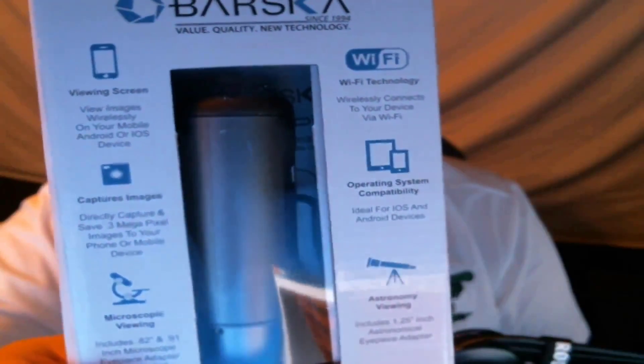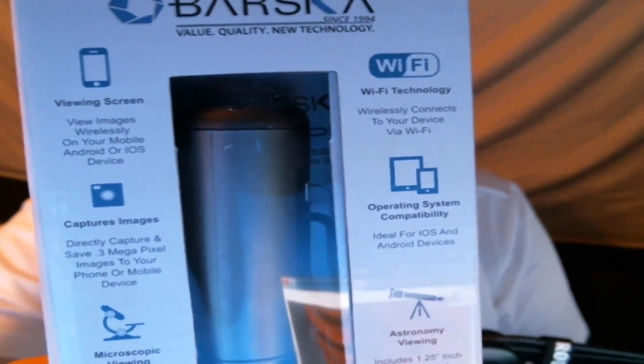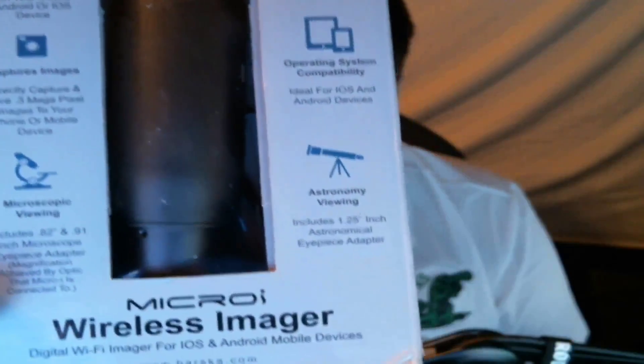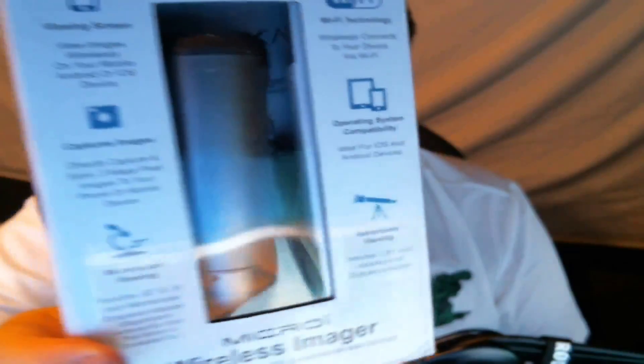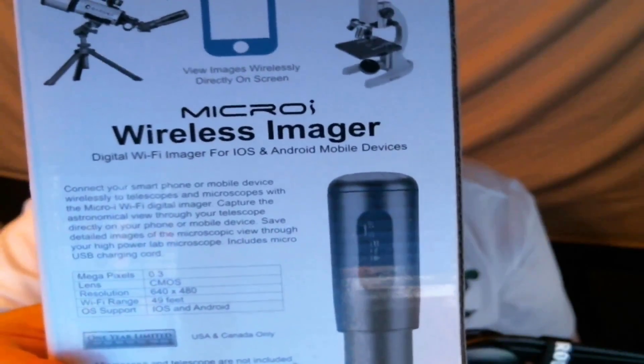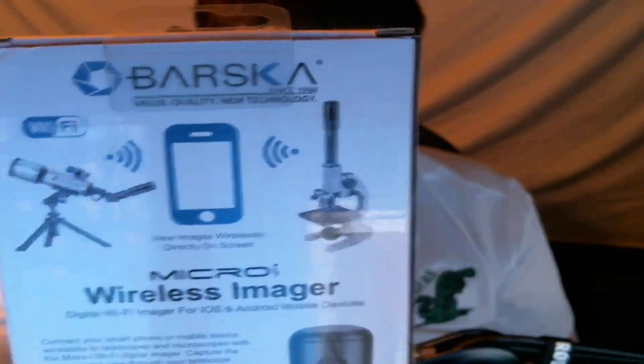Right off the bat from the box it looks like it is all made out of plastic. Feel free to pause at any time to get a look at the box. Here's the side view of it and here is a back view of it — hopefully we can get that into focus. I don't think I'm gonna show the bottom.